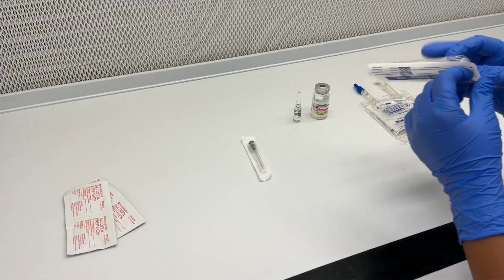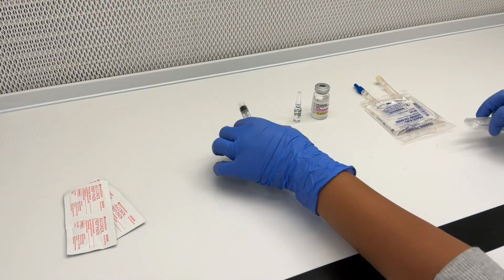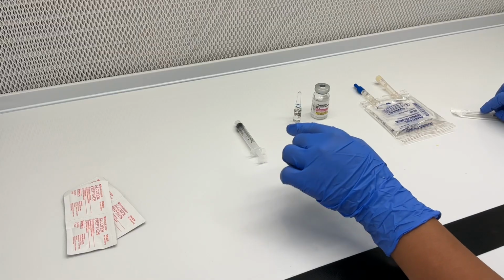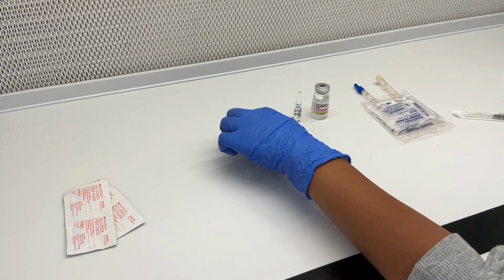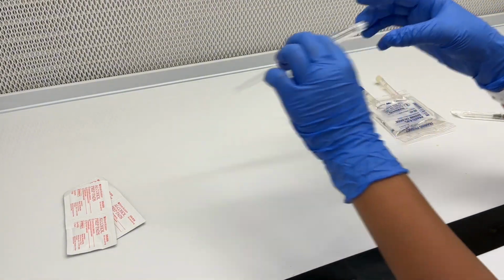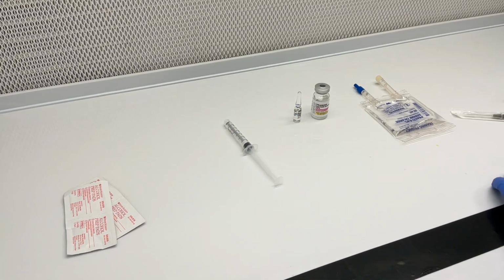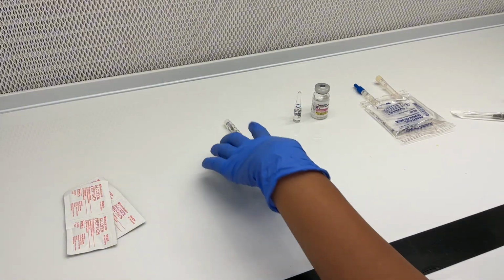For your syringes, this would be first air. Your plunger is not fully extended, therefore it does not have to be in first air until it is extended. Your hub is in first air. Now, if your plunger was extended, this would still count as first air because this is receiving airflow and so is this. This would not count because this is receiving airflow, but your plunger is not.